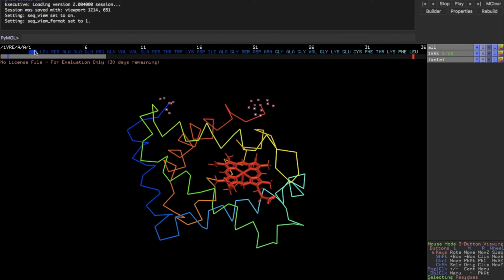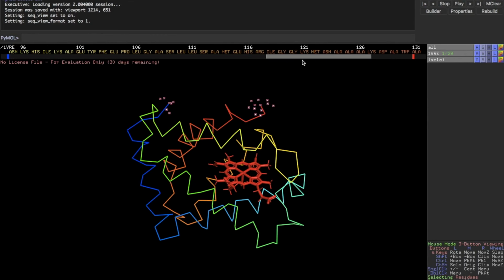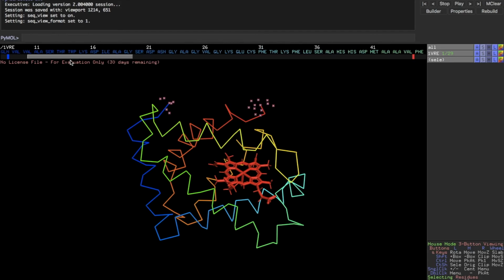The red end of the protein chain is going to indicate either the N terminus or the C terminus. How can you tell? Well, we know that glycine is the start of the protein, and we know that serine is the end of the protein, which means that glycine is showing the N terminus, the amino terminus, and serine is showing the C terminus, or the carboxyl terminus.